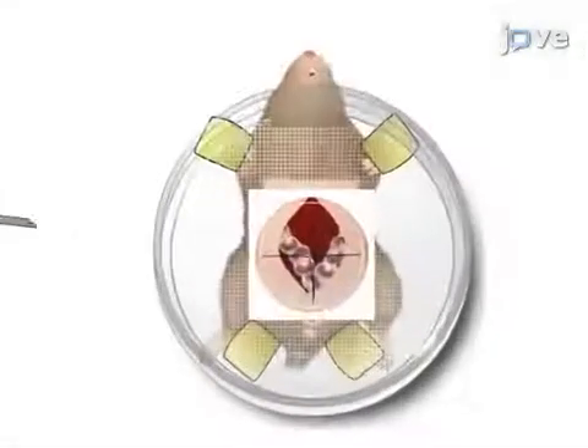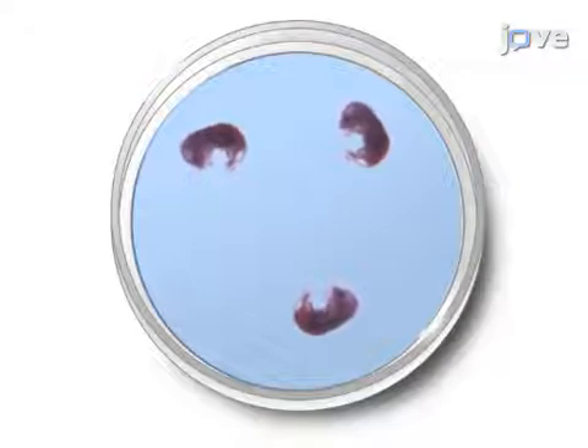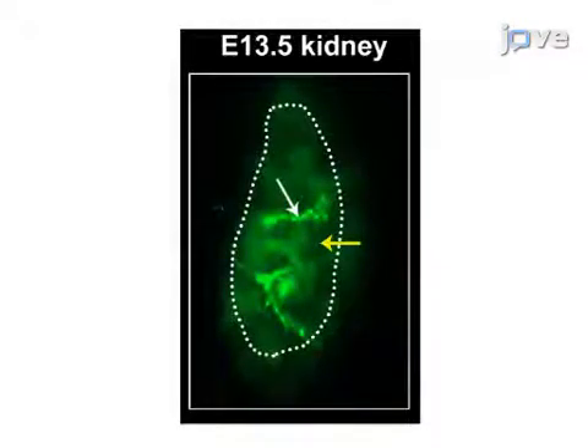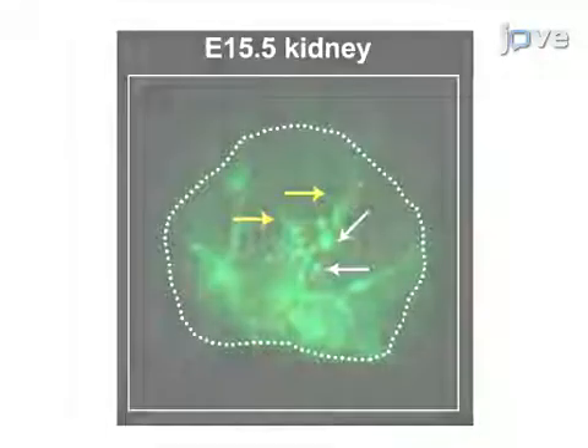Once all the embryos are injected, the dam is sacrificed and the embryos are processed as whole mounts or sectioned for immunohistochemistry and evaluation of blood flow. The results show a dynamic pattern of blood flow throughout the developing kidney, suggesting a role for blood flow in the maturation of the various kidney compartments.